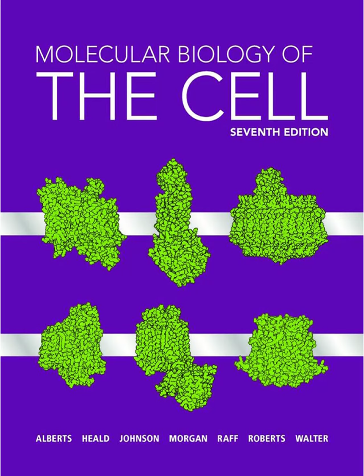So it's not just about having a perfect lens, it's physics. It's fundamental physics, yeah. And that ability to tell two close objects apart is what we call resolution. The key factors are the wavelength of light, where shorter is better, so blue light gives slightly better resolution than red. And the light gathering ability of the lens, which we call its numerical aperture. A higher numerical aperture means it collects more light angles, leading to better resolution. So best case is about 0.2 micrometers? Under ideal conditions, yes. But it's crucial to distinguish resolution from detection.